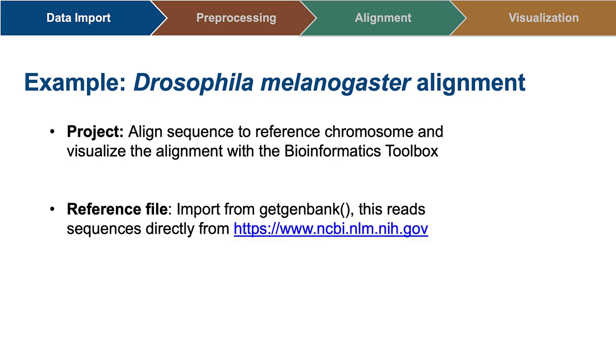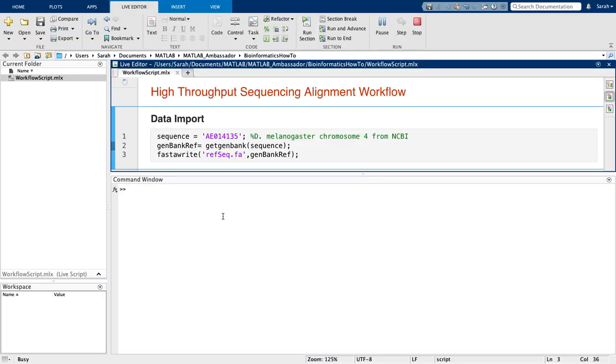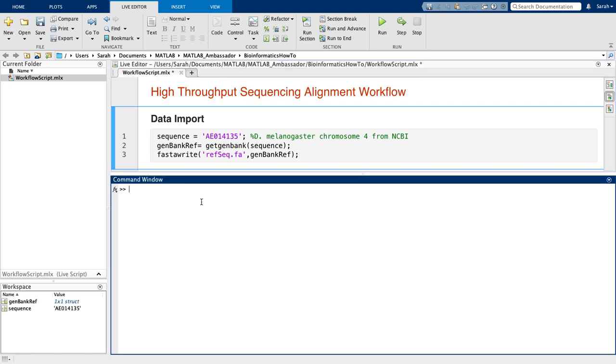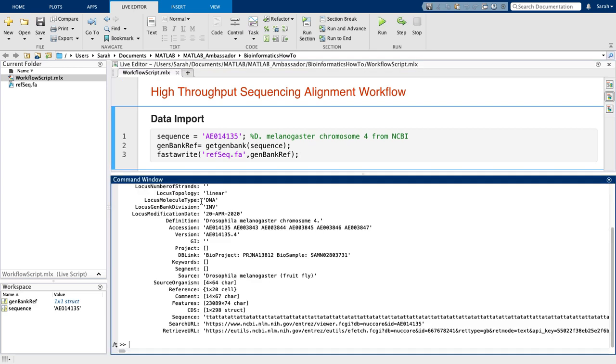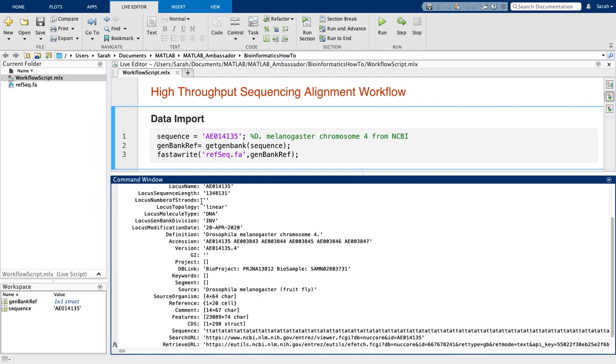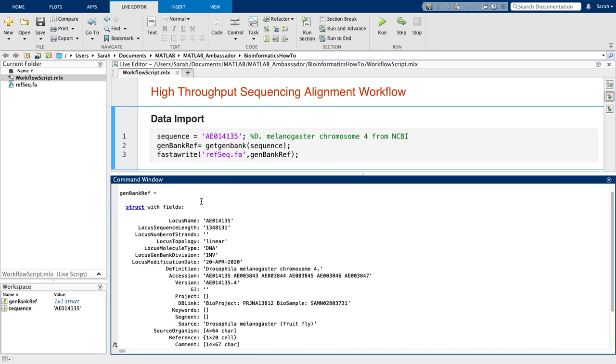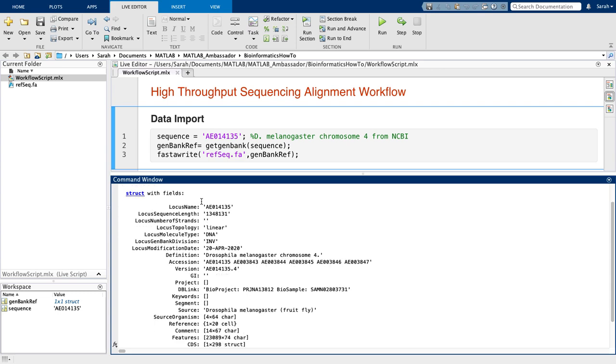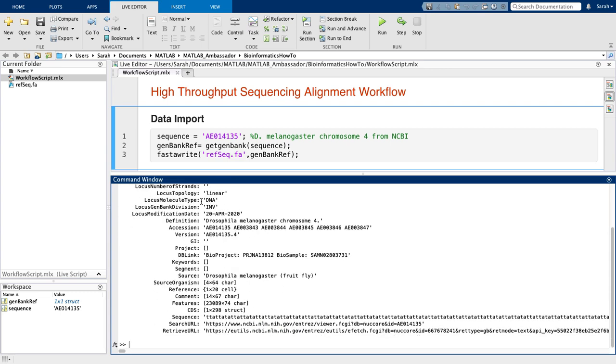I'll start with the reference. The bioinformatics toolbox function, GetGenBank, allows for the import of FASTA files directly from the NCBI website. All that is necessary is the accession number and an internet connection. If the file was stored on my computer, I could also use FASTA read to input it into my environment.